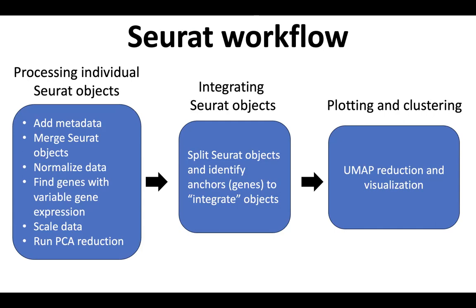Seurat offers a pipeline for data integration, and this will be important basically for anyone doing experiments where they want to compare two different conditions, because we want to ultimately combine our data sets and visualize them together, so we can visualize the differences between the data sets and the effect of a given variable on gene expression.